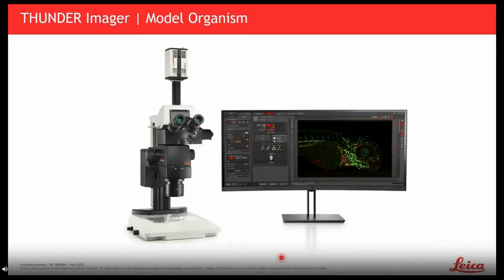The Thunder Imager model organism is a stereo microscope that is ideally suited for imaging whole model organisms, such as zebrafish, C. elegans, Drosophila, or whole mouse. To see how Thunder can be utilized on such samples, here again are a few examples.